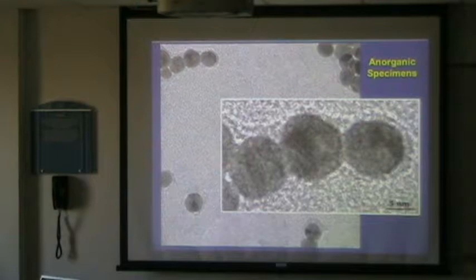What I said is an electron microscope can easily give you 2 angstrom, 1 angstrom resolution. These are gold grains, and these lattice lines here, this is the 2 angstrom gold lattice that you see here. So in principle we can easily produce a 2 angstrom image. The only problem is this is okay for something like gold, but on a biological sample that's far from being possible. And the problem is that the beam in an electron microscope, unlike a light beam, obviously has this kind of dualism.